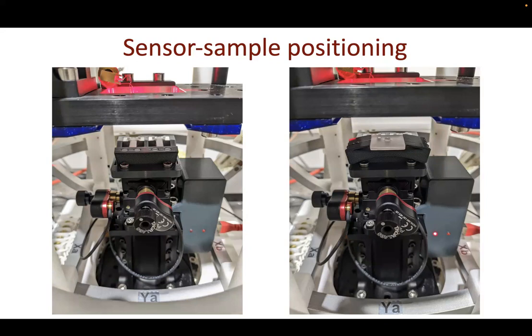James is a 5-axis sample positioning system: X, Y, Z, and 2 tilting axes. And the good thing is that you see here 2 of the 3 load cells. As soon as there's more than 0.5 gram of pressure on that thing, it stops moving.